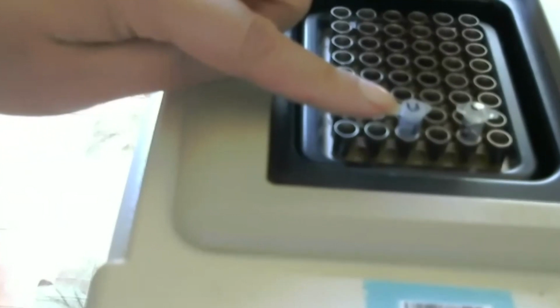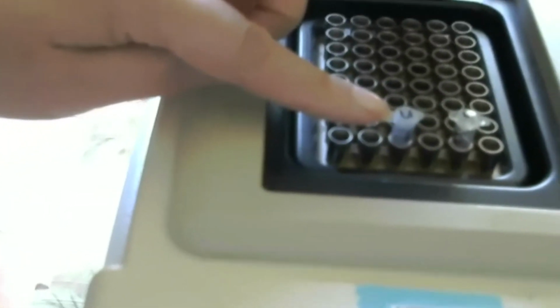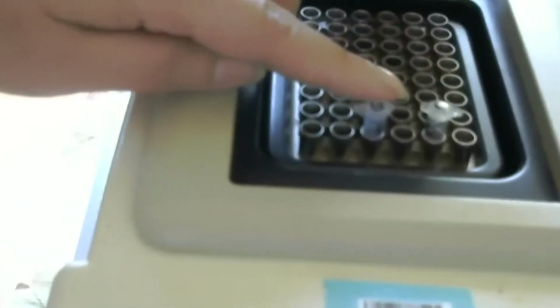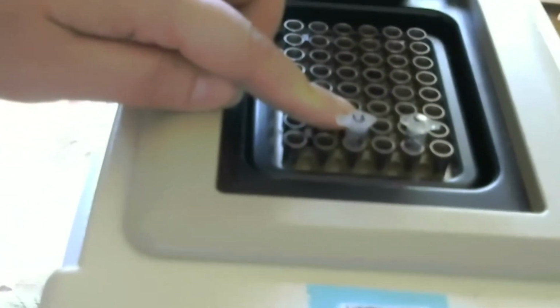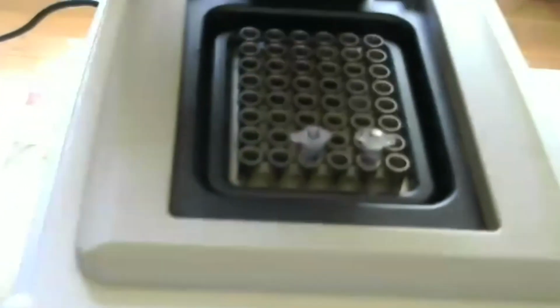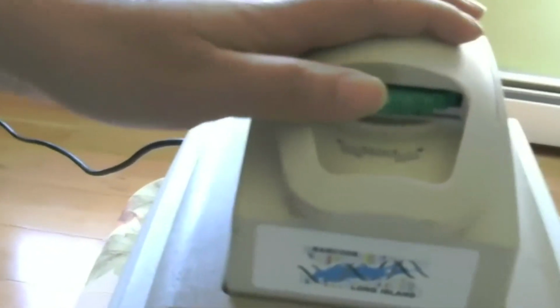I put my 2 tubes there, one labeled U, one labeled D. U is the tube where I didn't put any restriction enzyme, just 10 microliter of the PCR product. I put them shoulder by shoulder here, and I'm going to incubate them at 37 degrees for 30 minutes. So I close the lid, tighten it, and then start to run this.